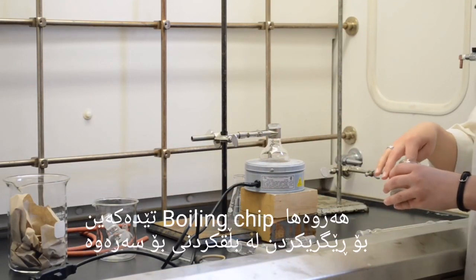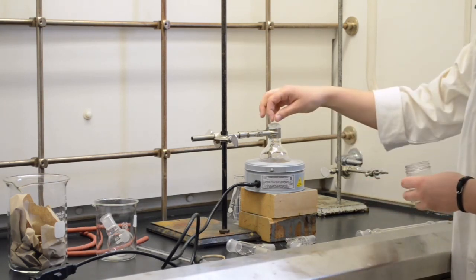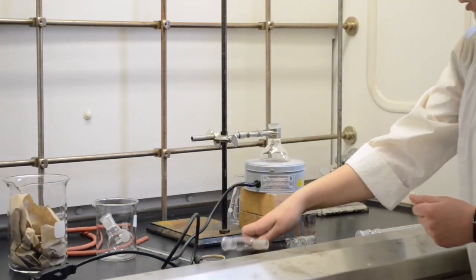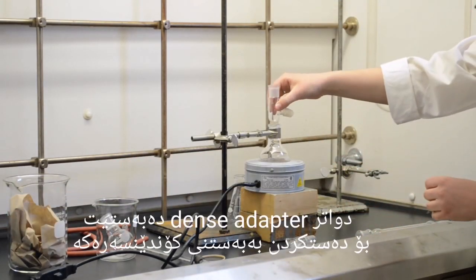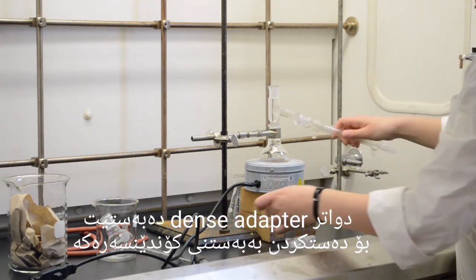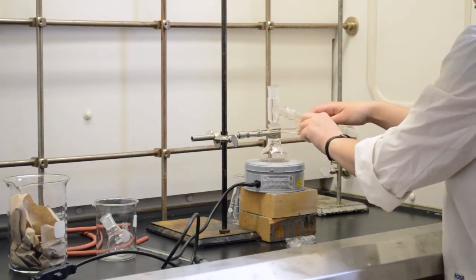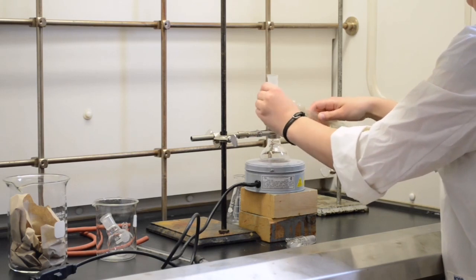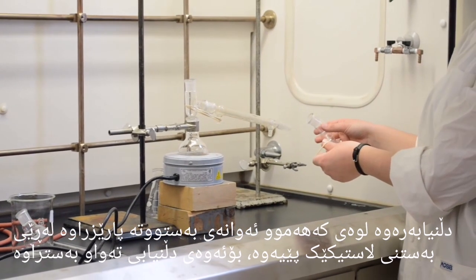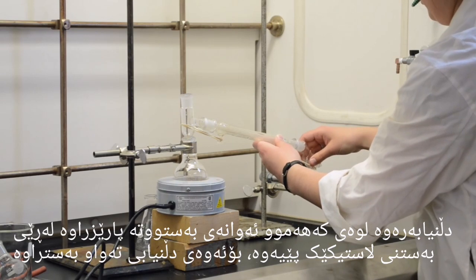Add a boiling chip or two to prevent bubbling over. Next, add in your condenser adapter and start attaching the condenser. Make sure that all of your joints are securely attached with rubber bands to make sure that they are tight and won't come apart.